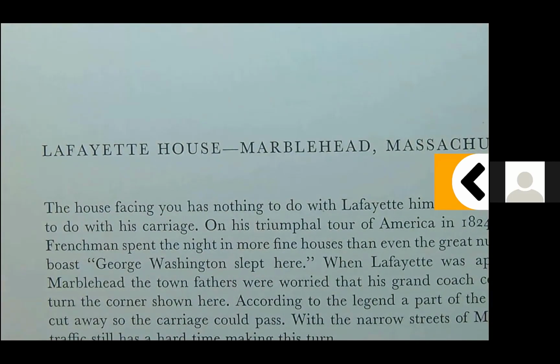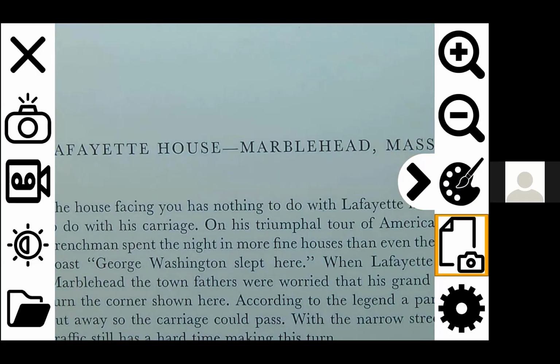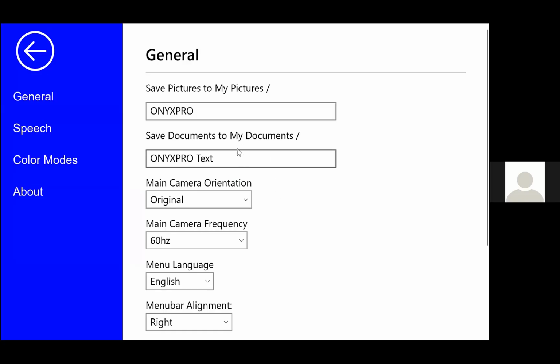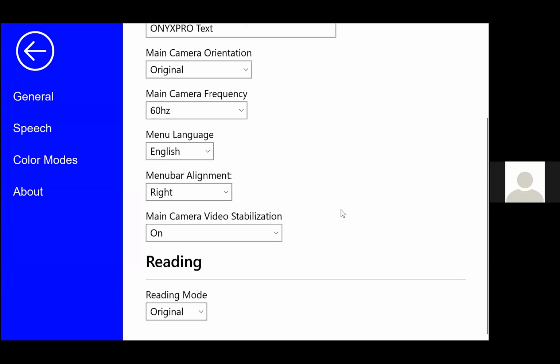Oh, I should go back in. So sorry, I closed out. So we're back to that live view. I want to go back into the settings one more time here. So bottom right. And also show you there. So Richard had mentioned saving, where your documents are saved. Your pictures are saved into My Pictures and the Onyx Pro folder. But you can customize this. If you want to name it something different or have them stored somewhere else, you can do that. And that's super easy right within the general settings.